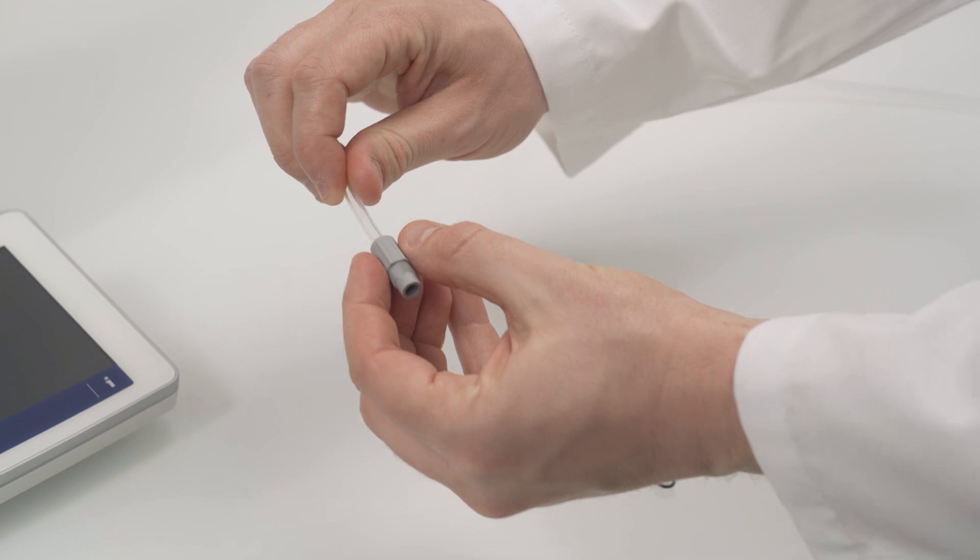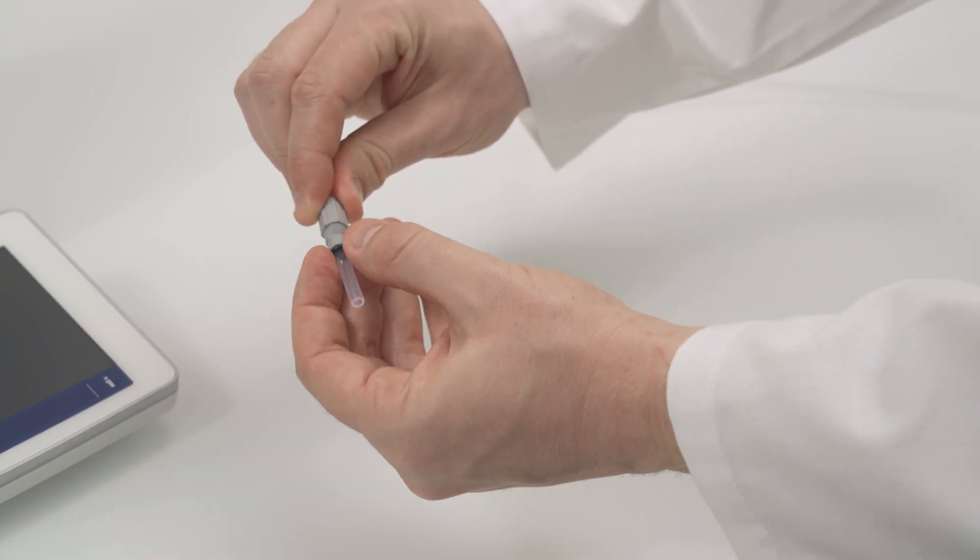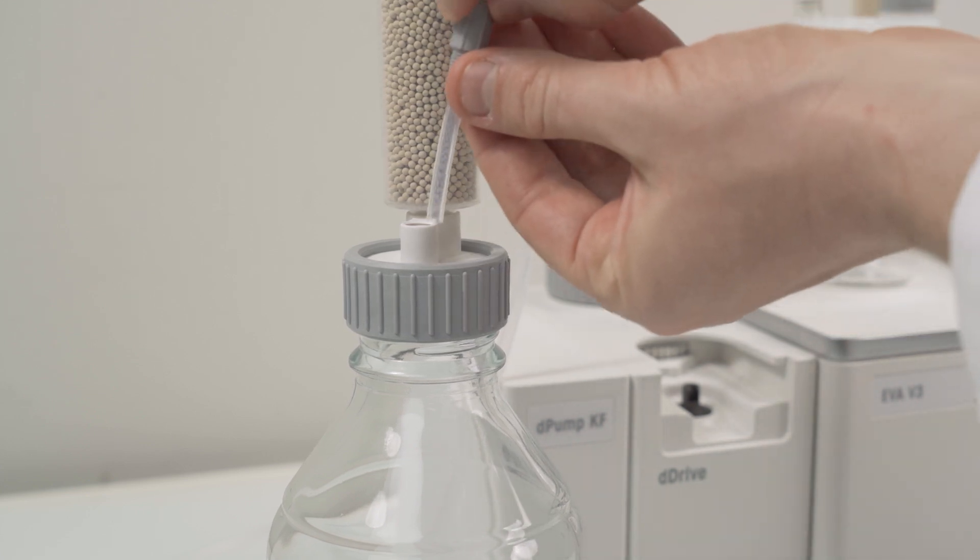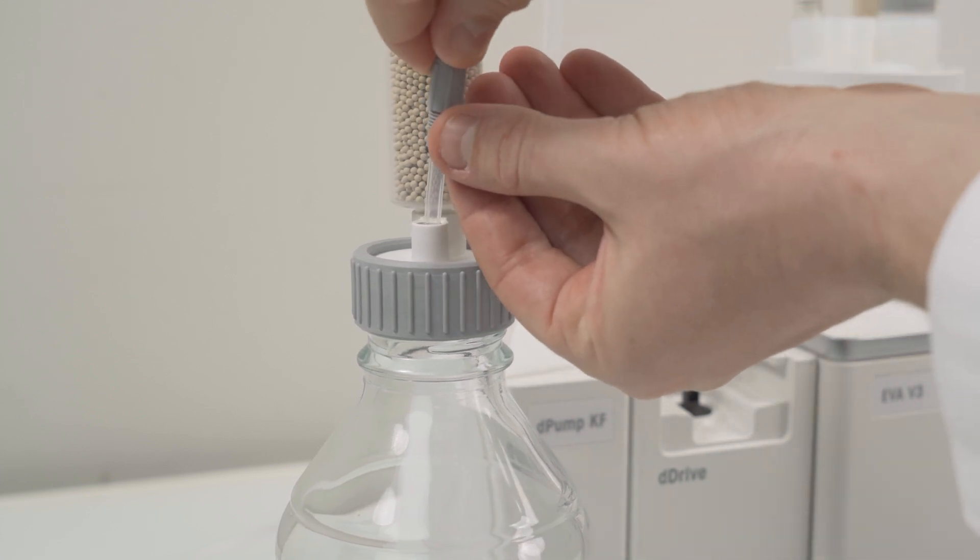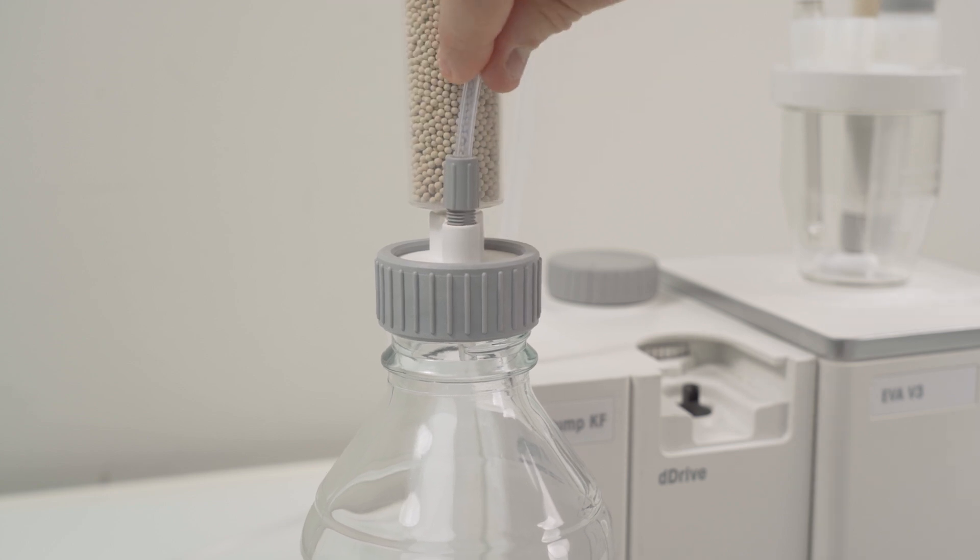Assemble the solvent tube with the O-ring and the adapter. Bring it to the waste bottle. Screw it in half way, push the tube down a little bit and then fix it by screwing it down completely.